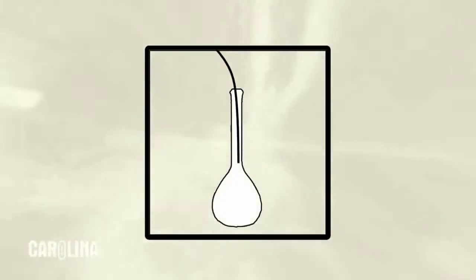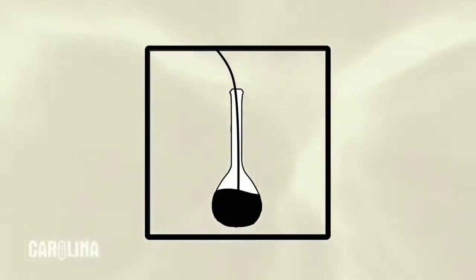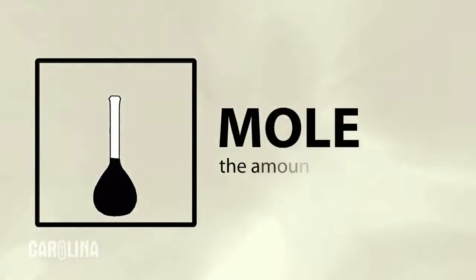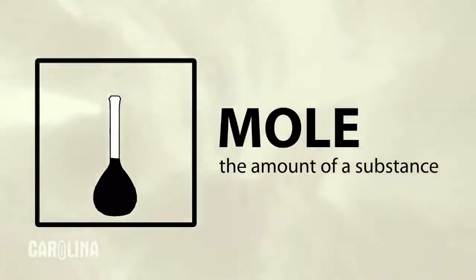Today, we will be preparing a solution of sodium chloride using a small amount of sodium chloride as our solute, added to a larger volume of water, our solvent. Before beginning any experiment, it's important to observe appropriate lab safety procedure and know the hazards of any chemicals you're working with. In any chemical reaction, it's important to keep track of the exact amount of reactants present, and for stoichiometric purposes, we use the term mole to define the amount of a substance.